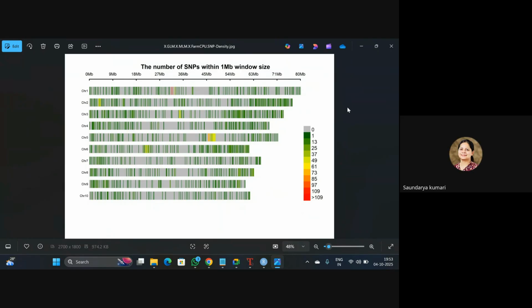Okay, so this is the distribution of markers on different chromosomes. Within this region, 0 MB to 80 MB, is there. So in that region, how these SNPs are distributed across the chromosomes, across your locations, at 27 MB, 28 MB, 30 MB, 32 MB, whatever it may be.